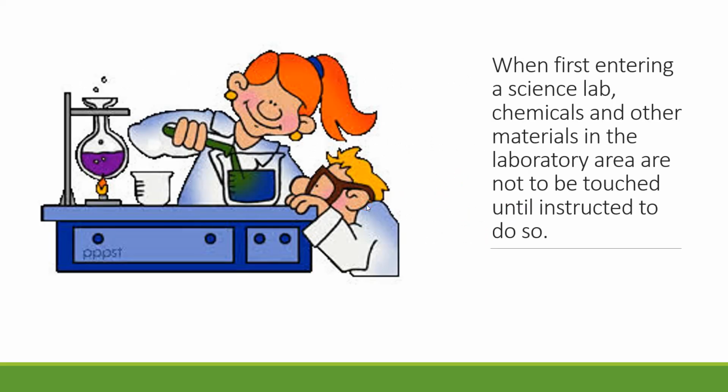One of the other things to always recognize is when you are entering, especially a microbiology lab, there's certain protocols you need to put into place. These definitely can be extrapolated to a clinical setting and going into a patient's room. Whenever you are entering the lab, you're not going to touch anything. The first thing you're going to do is wait and figure out what your instructions are for the day.